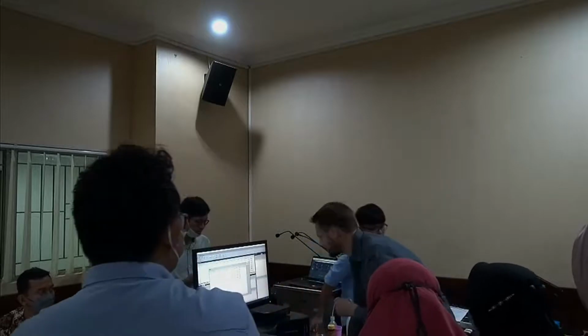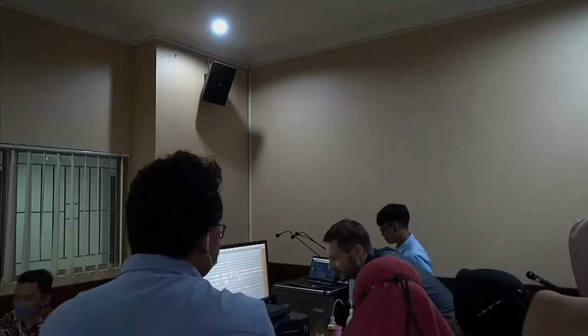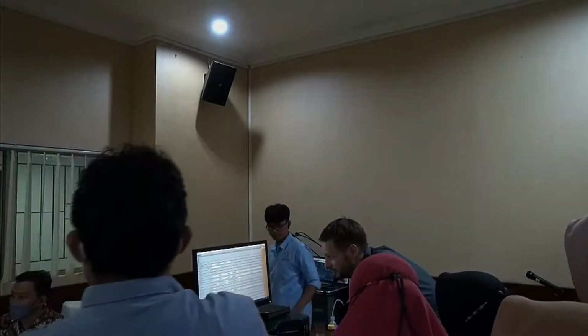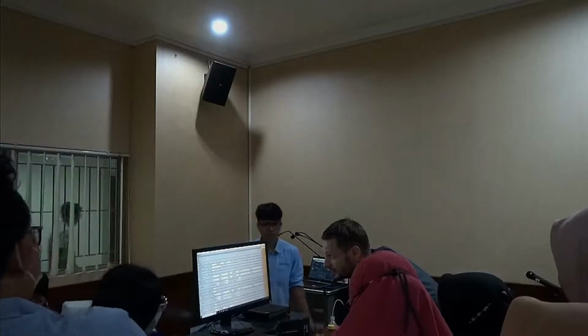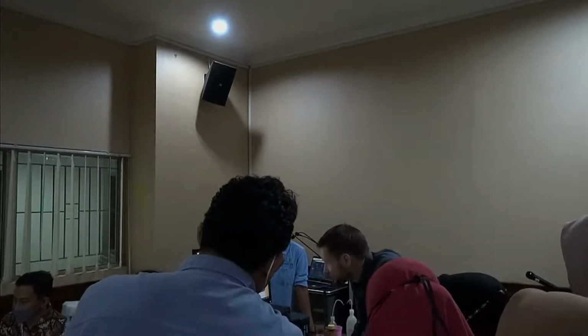So the next thing I would do now, I would take another SOP. Yuri, you made one where you have 2 sets of measurements, remember? Was this the last one, SOP for manual fill? The one you programmed yourself, remember? I think it's this one. Yes, oh, I can actually just check it. So he, on the training, was actually very, very good at making himself an SOP where you have 2 sets of measurements.